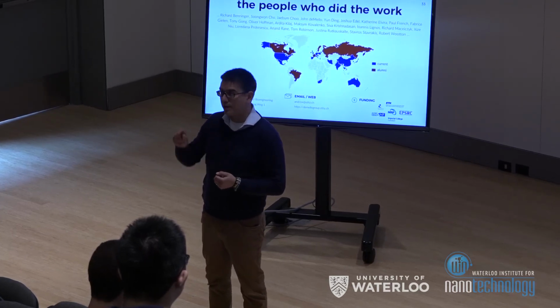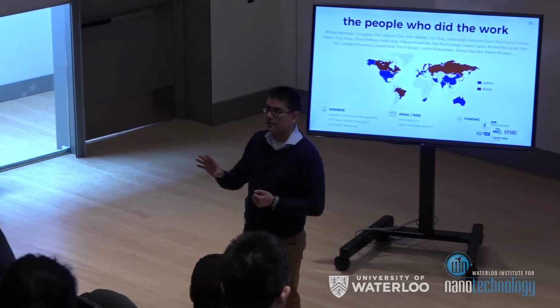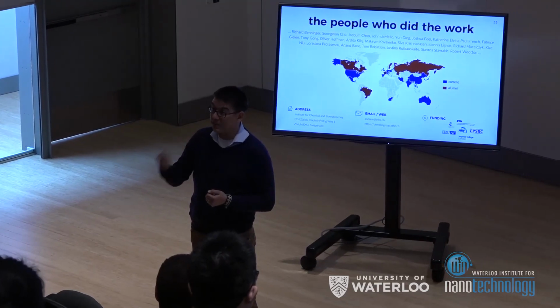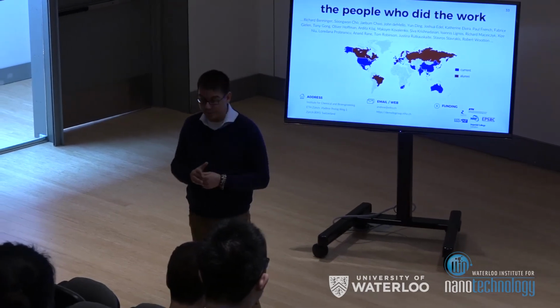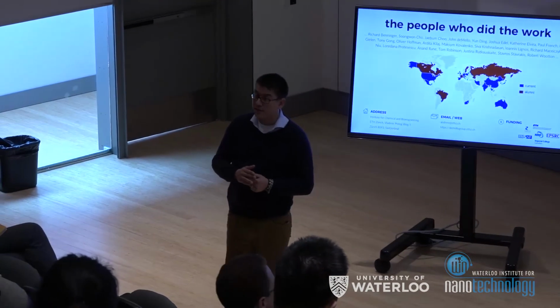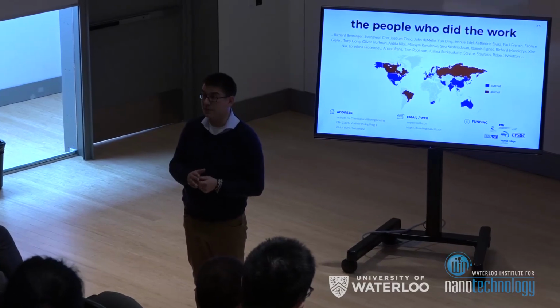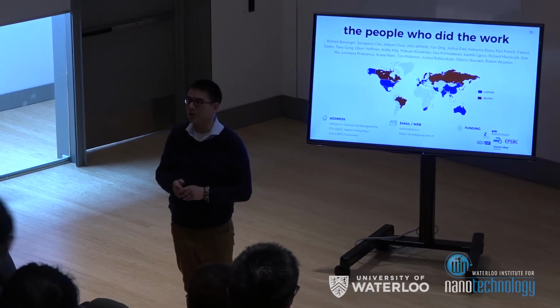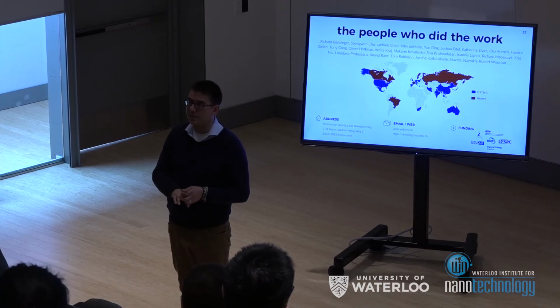However, I should say that we can also do infrared measurements. So focal plane array detectors over the last few years have completely changed the ability for actually imaging with infrared to pull out information. And in fact, it's data I haven't shown here, but we published about 4 or 5 years ago that you can use infrared imaging to extract the same vibration information for segmented flows as well. So we effectively use, to actually answer your question, a home-built confocal technique, which allows us to do this, but it's going to be very substrate dependent.